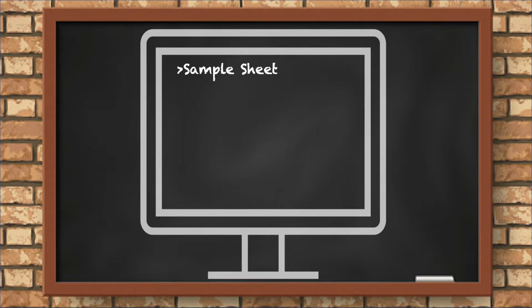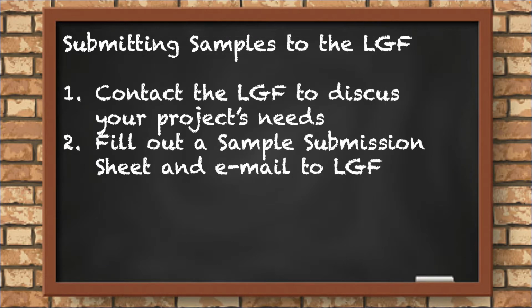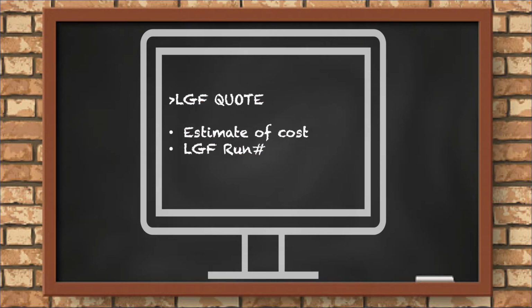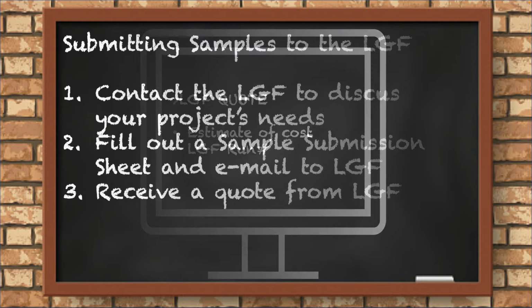Send your sample submission sheet by email to the LGF, and in the next step, you will receive an LGF quote listing services and cost, and you'll be assigned an LGF run number identifying your experimental samples.